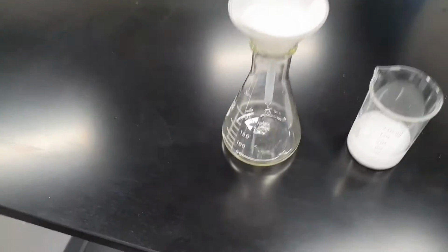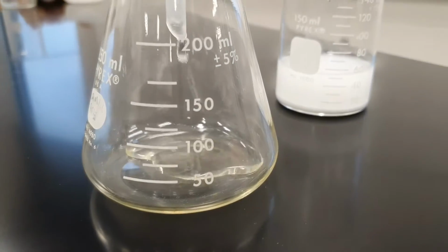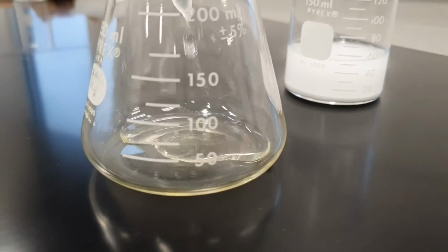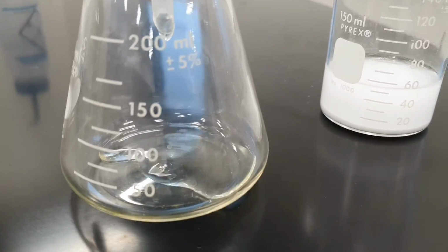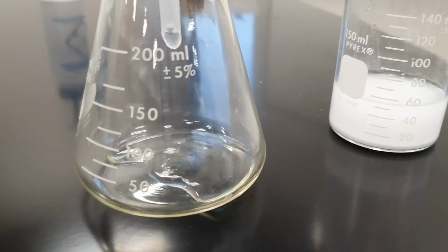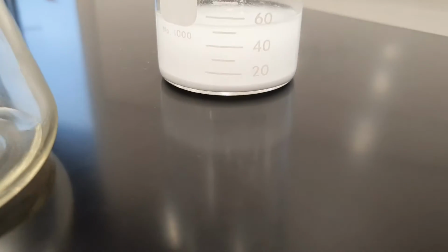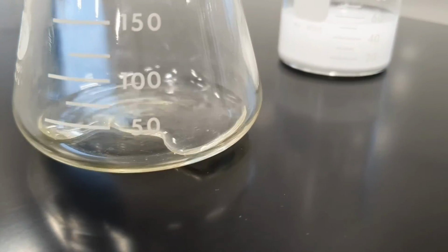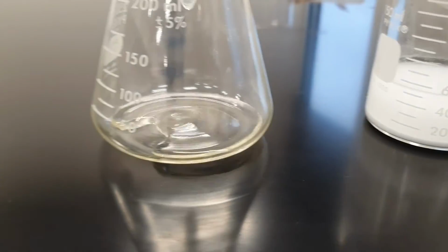Okay, so as we're filtering it, what we can see is the solution that's coming through looks really, really clear. So here was our original solution, how cloudy it is, and you can start to see that layer of solid sitting out there at the bottom. And then here's the filtrate solution that's coming through our Erlenmeyer flask there.